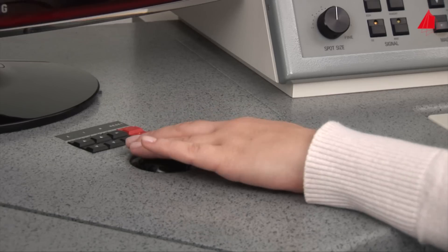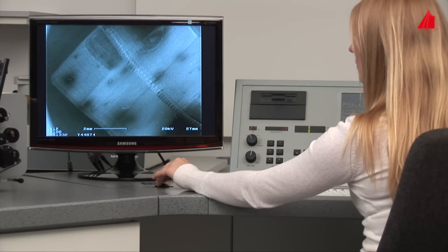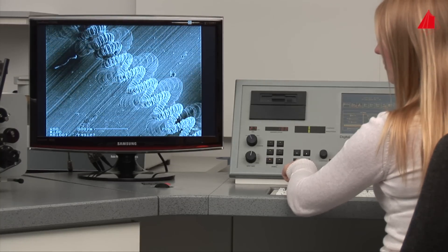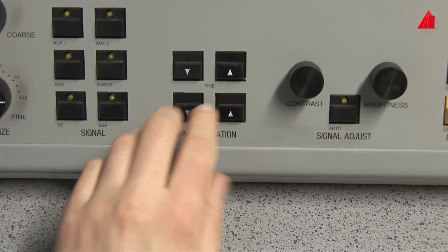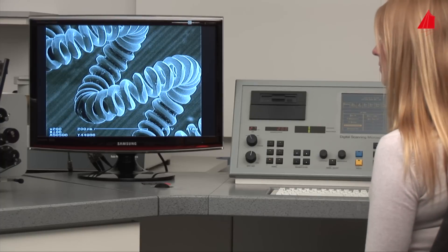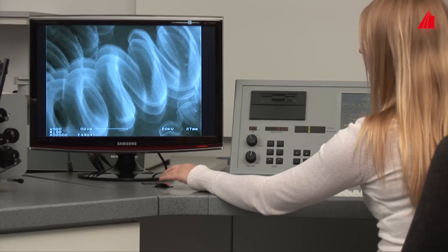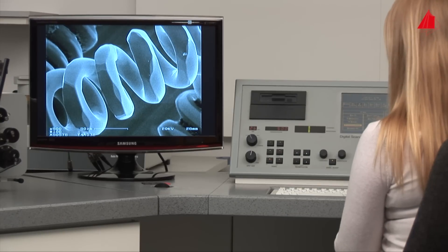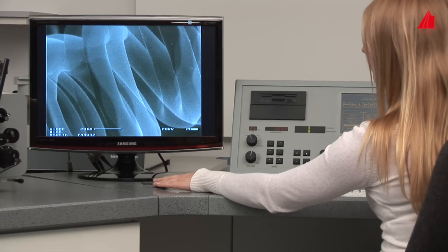She is examining the used filament. The magnification is gradually increased, the position readjusted, and the magnification increased again. A plastic, high-contrast image of the filament appears on the monitor. Originally the coiled-coiled filament was quite smooth on the surface, but caused by everyday use, new crystals have formed — tungsten atoms have evaporated and the outer regions of the filament have become polygonal.